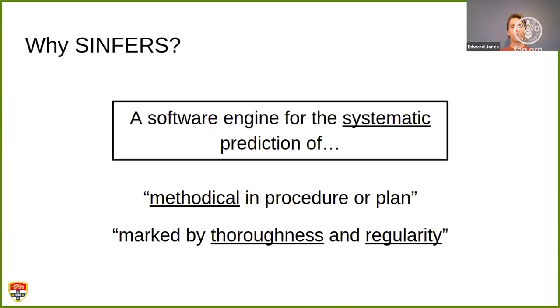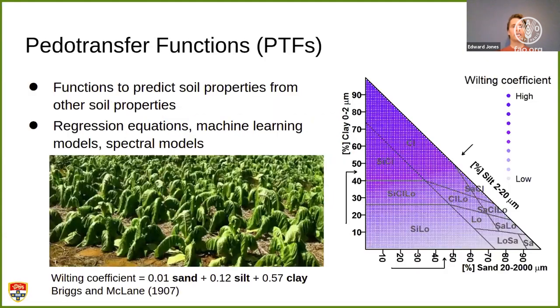So first, following on from Alex's definitions, SINFERS is a software engine that facilitates systematic prediction of soil properties from other soil properties. And systematic in this sense means methodical in procedure or plan, and that it's marked by thoroughness and regularity. And I'll demonstrate that soon, but just taking a step back, as Alex says, pedotransfer functions, we can't understand SINFERS without understanding these pedotransfer functions, or PTFs.